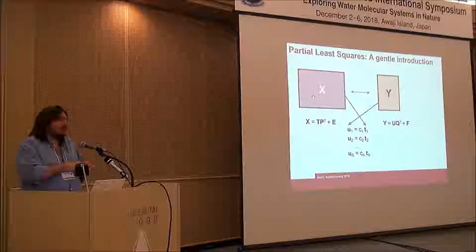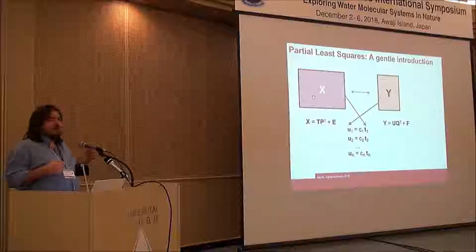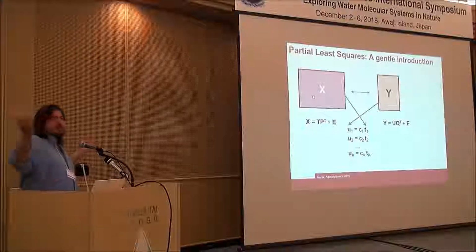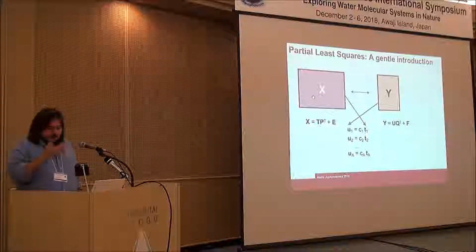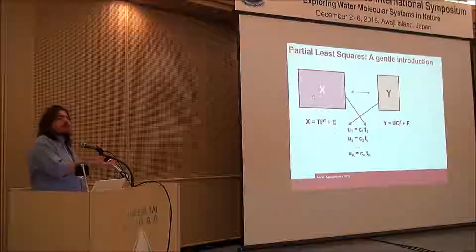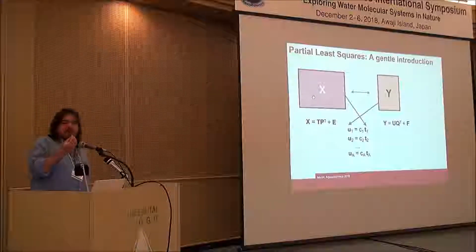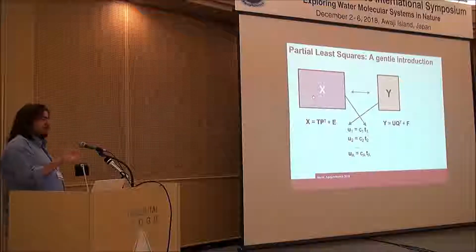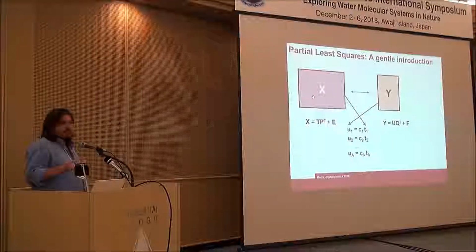So it's not only because, when we introduce methods, we say that when we cannot use MLR because we have thousands of variables, we go to PCR, principal component regression, or PLS because then we can calculate the model. It's not only because of this. It's because we want a meaningful representation of our data also in the domain of multivariate calibration.